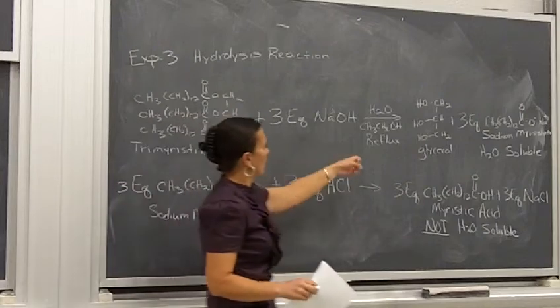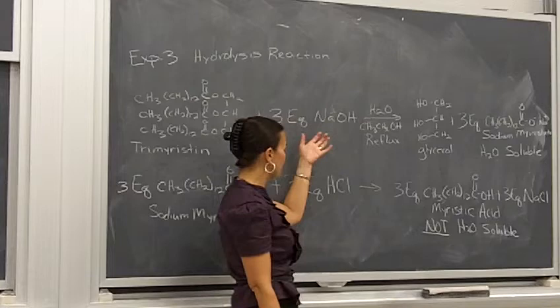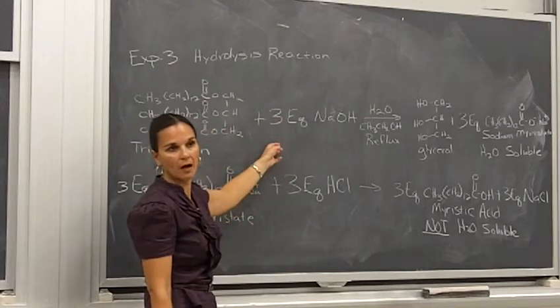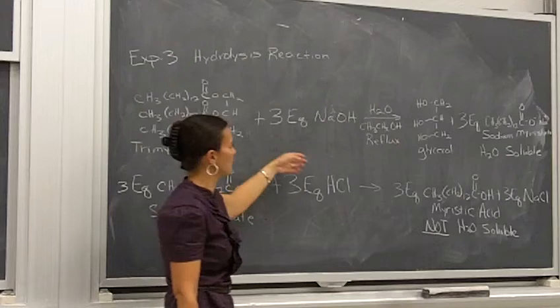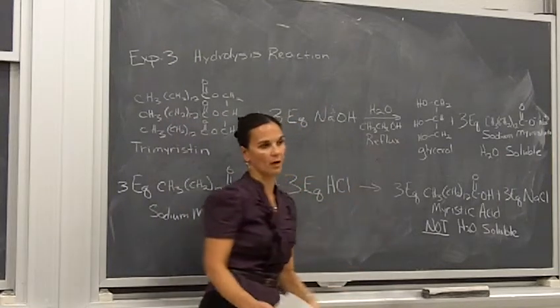So this reaction probably, maybe eventually, if we just let it sit for a while, would happen on its own, just sitting there at room temperature, but it's not going to work very well at room temperature. It's not going to work in your lab time very well at room temperature. So we need to use something called reflux to help it along, all right?